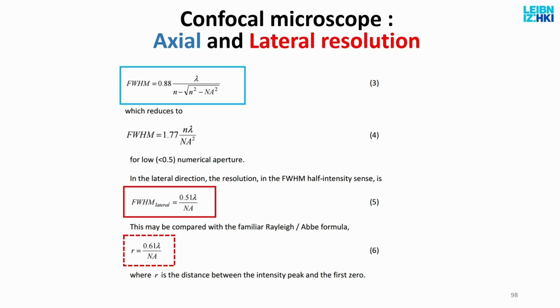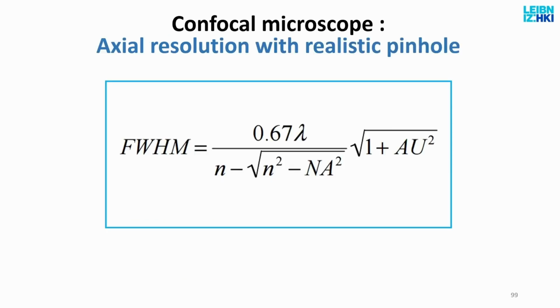Resolution, there are formulas which you by no means should remember, with which you can calculate the axial and the lateral resolution. And this is the little difference, the 20% difference that, as I mentioned, in lateral resolution between a fluorescence wide field microscope and the fluorescence confocal. So keep this in mind, but don't memorize it.